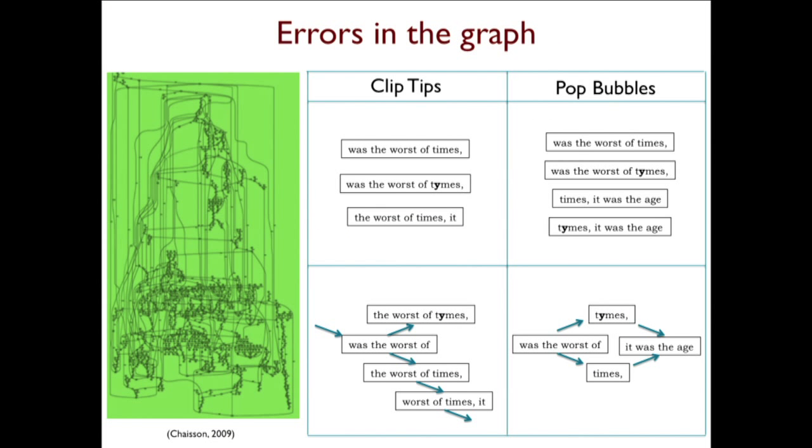So just to give it a little more detail, the errors, for example, is if there's a little substitution error. Here I'm simulating a little typo in the data, where instead of an I, you have a Y. From the point of view of the assembler, it's going to be making up this big path here, but it's going to have these little parts that stick out. This is sometimes called a little tip. The assemblers are quite capable of recognizing this, clip that off, and then hopefully come up with a bigger contig.